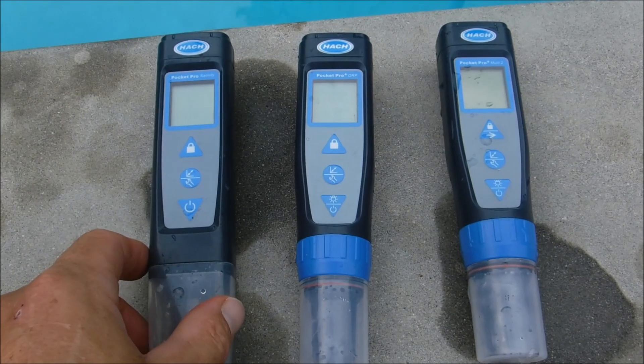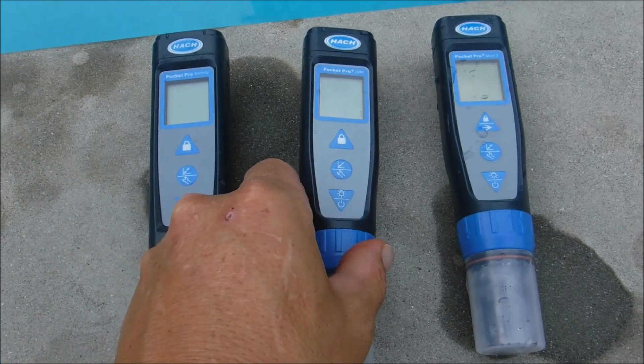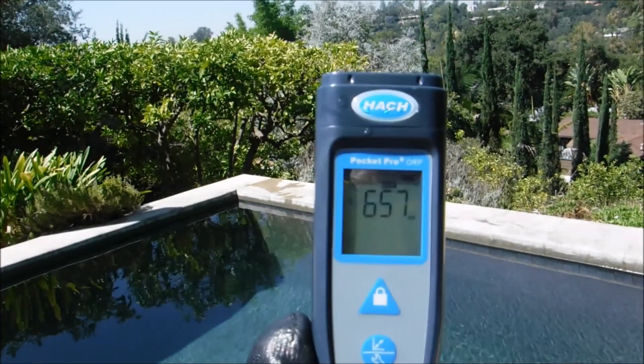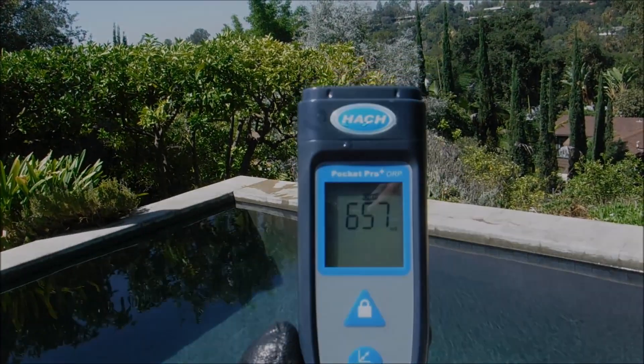The Hawk makes a tester that would meet your needs. You have the single testers for salinity and temperature, you have the ORP, and then you have the multi tester. Using the Hawk Pocket Pro testers is a great way to make sure that the pools on your route are safe and the water quality is good.